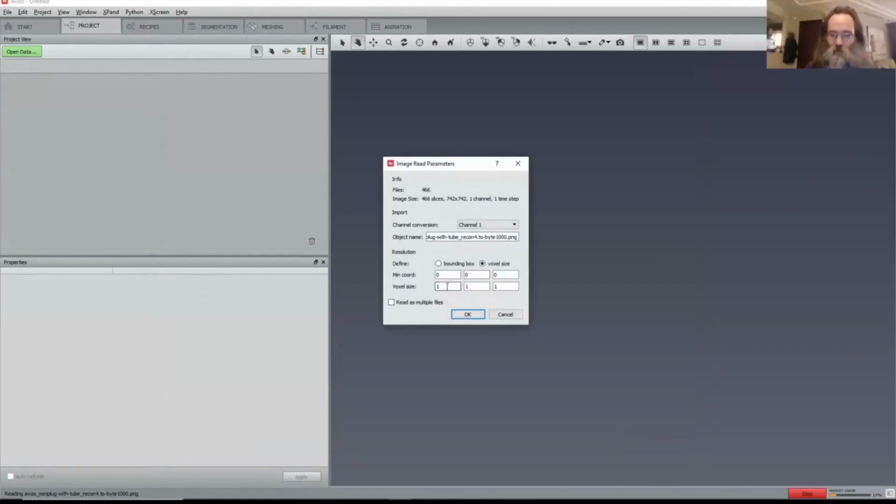I actually know the voxel size here is 14.6397 in X direction. And this is in micrometers, actually, 14.6397 also in Y direction. And in Z direction, we have 14.63. So this comes from the specifications of, in this case, the CT scanner. And that's what you should know when you get your data set, let's say, from the imaging core lab. In this case, I know this. It's almost cubic, so that's actually good, but not completely.